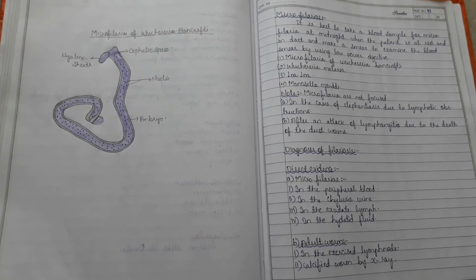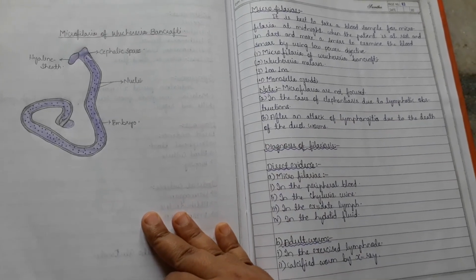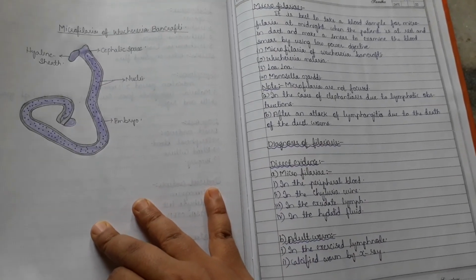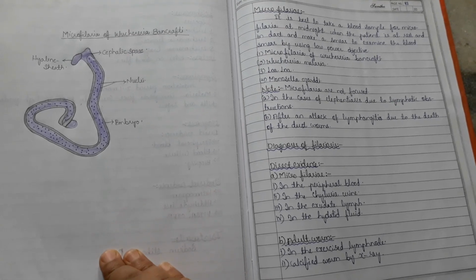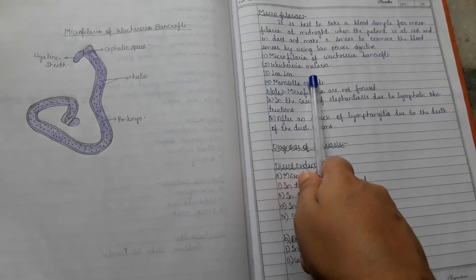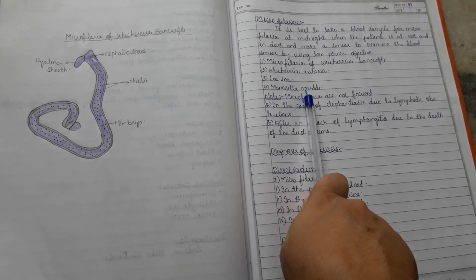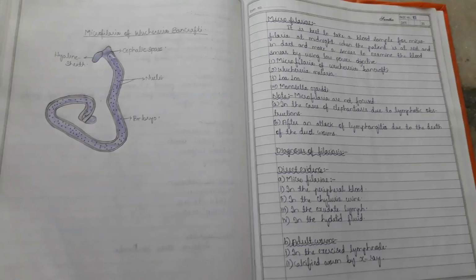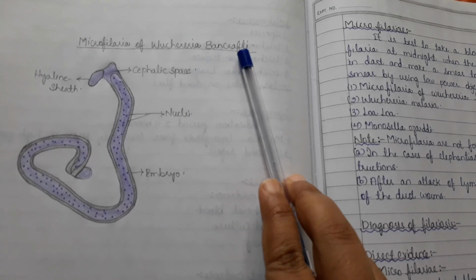So coming to microfilaria. Microfilaria of Wuchereria bancrofti, Brugia malayi, Loa loa, and Mansonella ozzardi. So this is a picture of microfilaria of Wuchereria bancrofti.